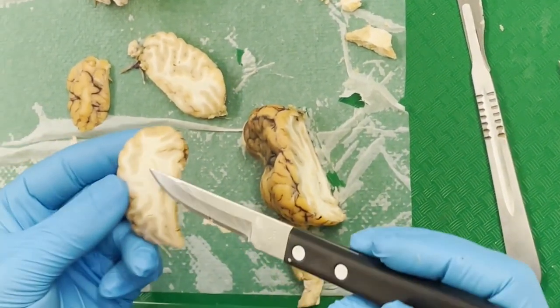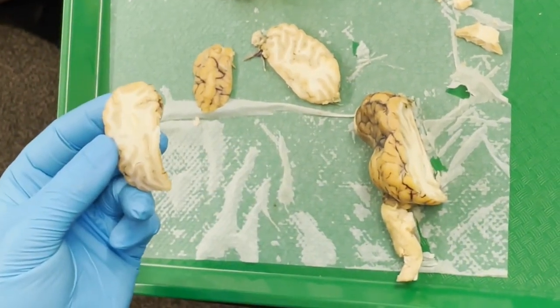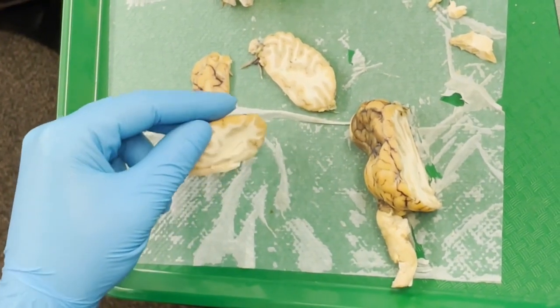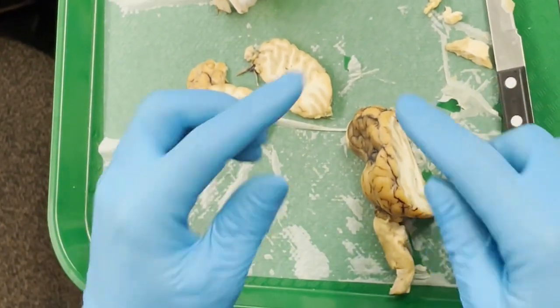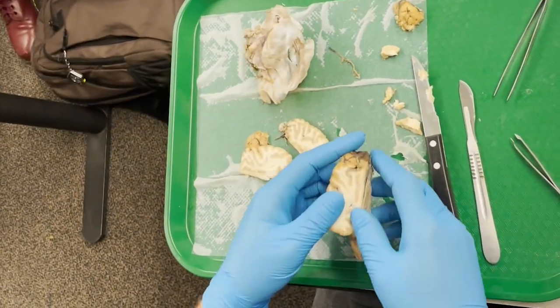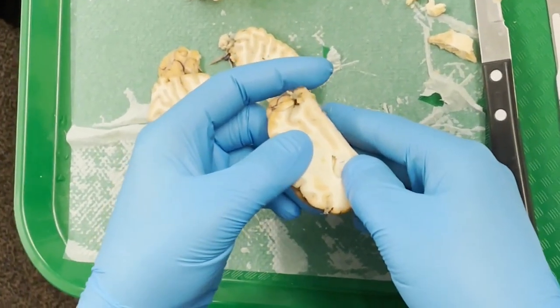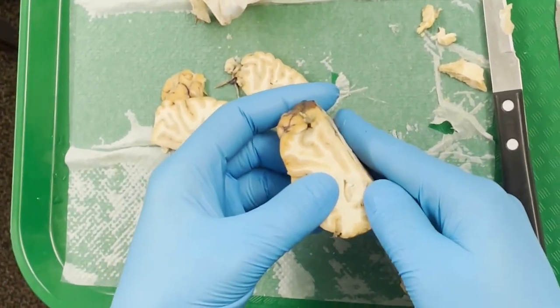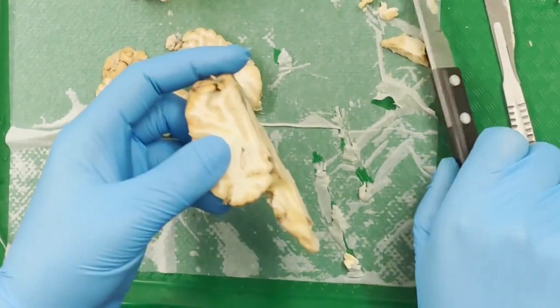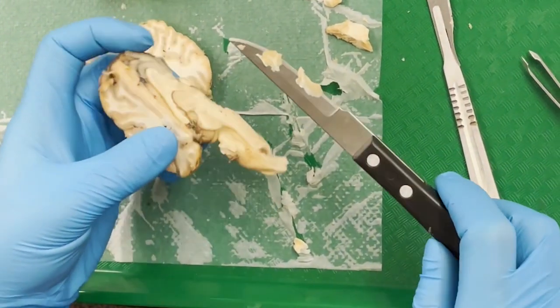So first, there's a little indentation of where the lateral ventricle first starts, like the dorsal piece of the lateral ventricle. The lateral ventricle is kind of like a triangular shape. So what we're going to end up seeing here is that the lateral ventricle will start opening up here, and this top part is part of the hippocampus that will be peeling out. So we don't want to cut into this any further. Instead, we have to liberate the hippocampus.